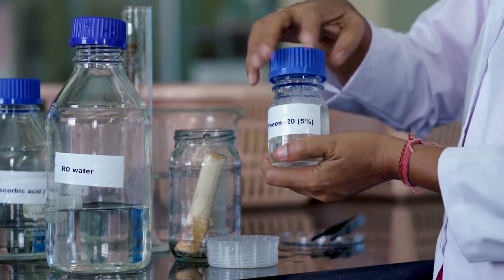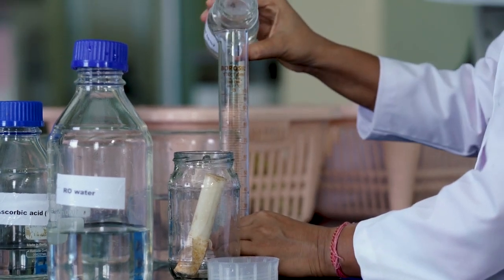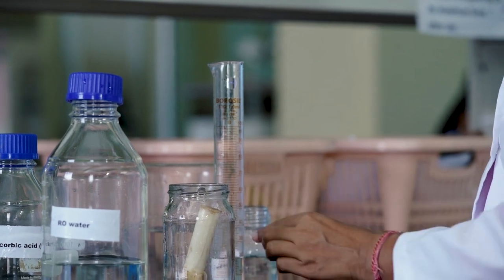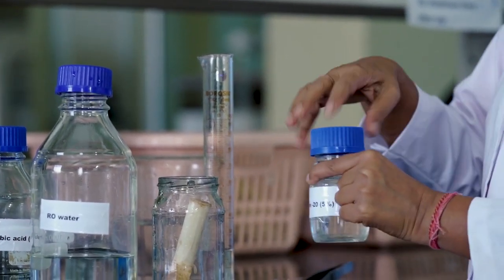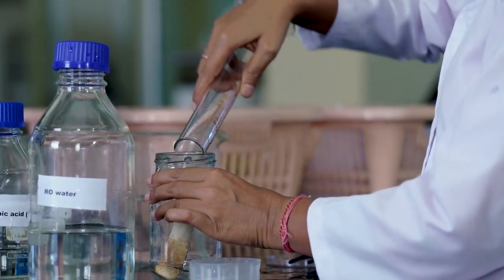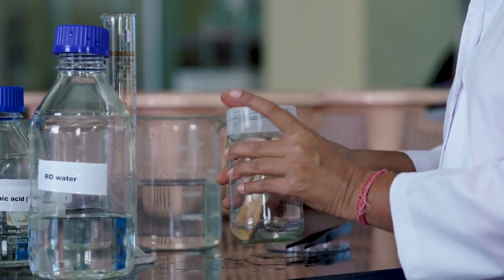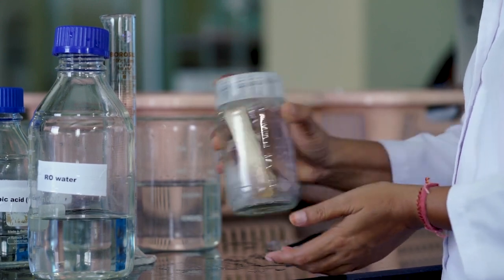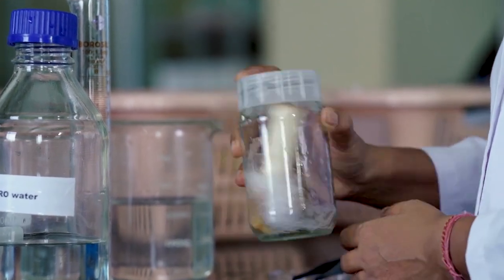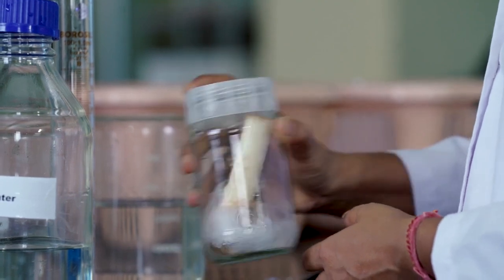In this case, we will be taking Tween 20 at 5%. Tween 20 is a detergent which is normally used to wash the explants to prevent any contamination. Here you can see we have used 5% Tween 20 to wash our explants. This process can be carried out for 2 to 3 minutes.